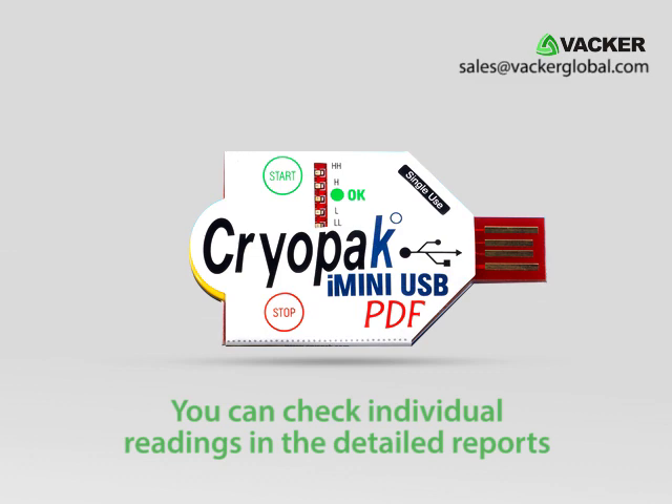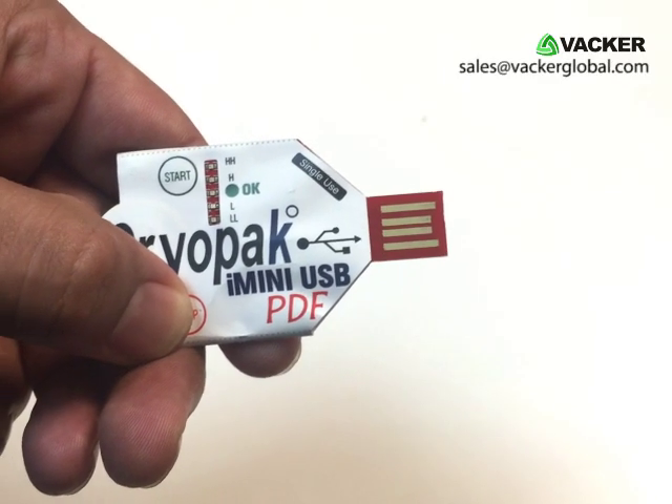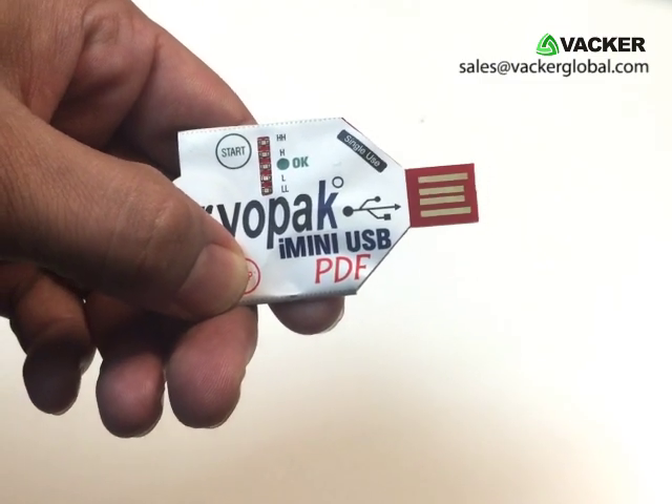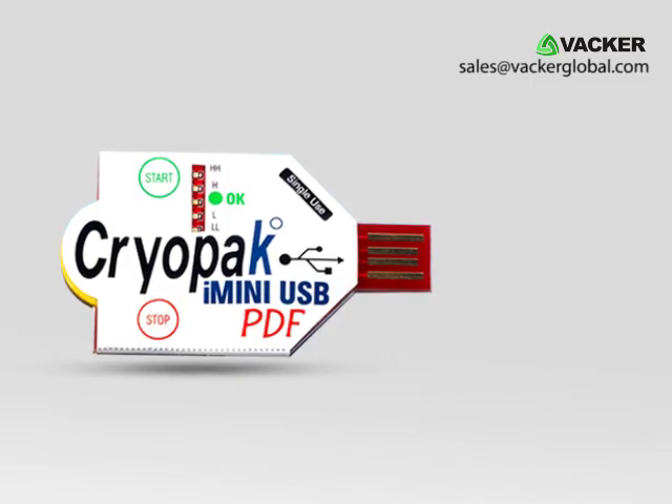You can check individual readings in the detailed reports. To stop recording, you can either press the stop button for a few seconds or insert the logger into a computer. Upon insertion into a PC the recording automatically stops and reports are generated.